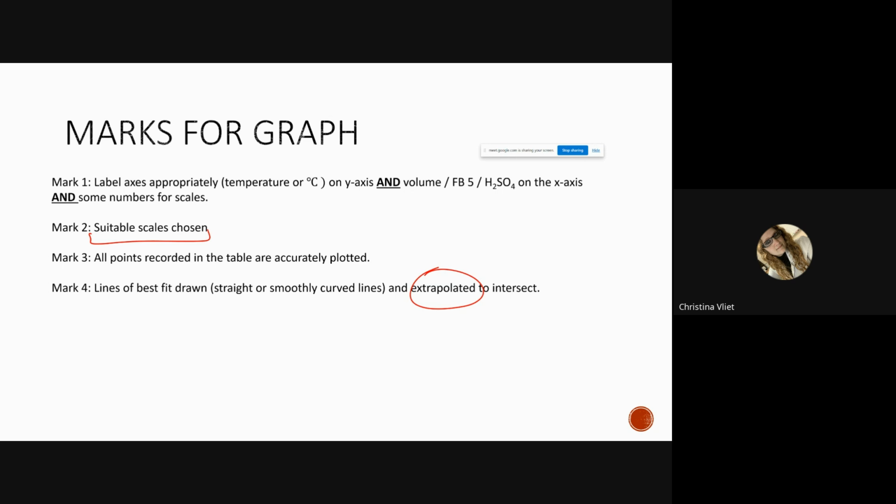It should be around 30, right? So this is your 30. What was your initial temperature? The first reading. So you do 30 minus 17. And that's the information you need for the math later on. It's that number. So you read between 20 and 25 and you have that one.